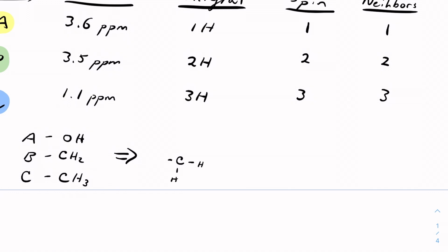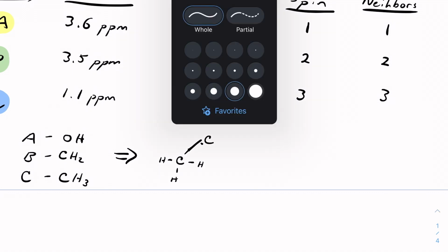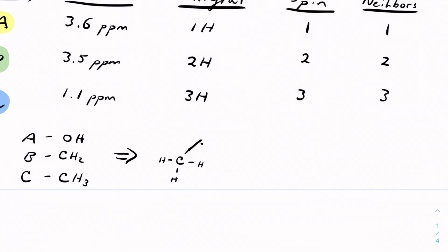And that's going to be attached to a CH2. I'm going to go ahead and make that bond a little longer just for ease of drawing. And I'm just going to fix that a little bit. Go ahead and do that. We have another C, and this time it's H2. And then we have it bonded to an O, bonded to an H.